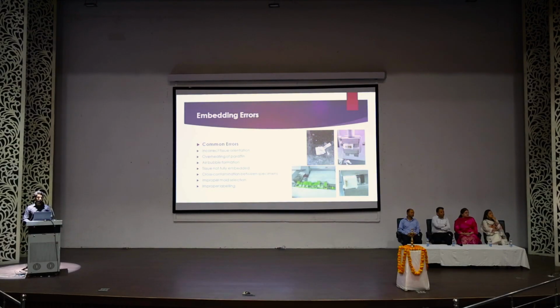What does this overheating cause? It causes irregular shape of the block and causes cracking in blocks during cooling, and affects the quality of sections and during section taking in microtomy.